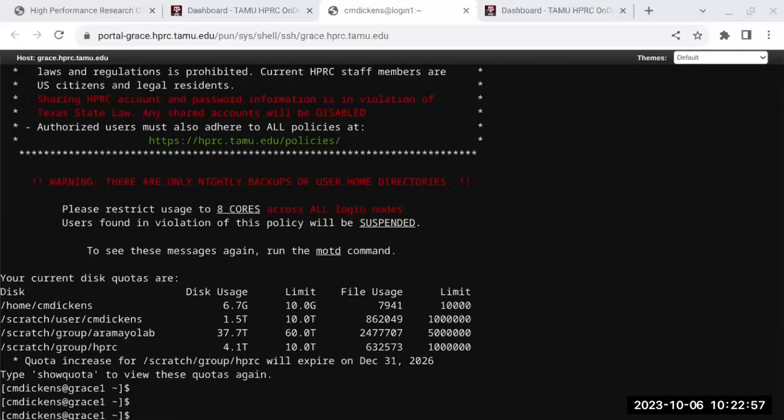And notice like L3, this little fragment in the middle, there could be some overlap where you have sequencing from both ends, and there is actually some overlap. So there's a region that you sequence twice. And that can be useful in some cases, and I'll show you how we can take advantage of that region.